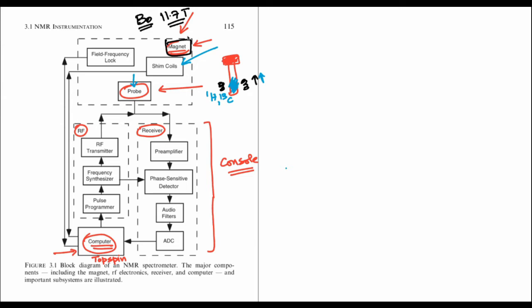And this is achieved by the use of superconducting coils. Superconducting coils are ones where, when you reduce the temperature, they have almost zero resistance, resulting in the fact that you could have the highest of magnetic fields that could be obtained. Nowadays, there is a serious quest for people trying to achieve superconductivity at room temperature, and if it does happen, NMR would benefit significantly from it.